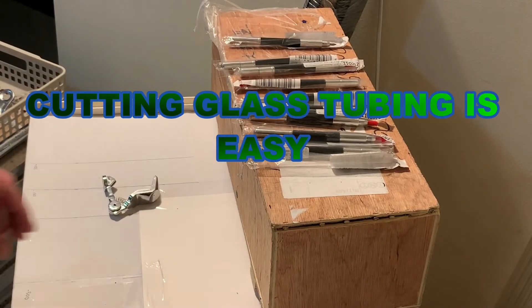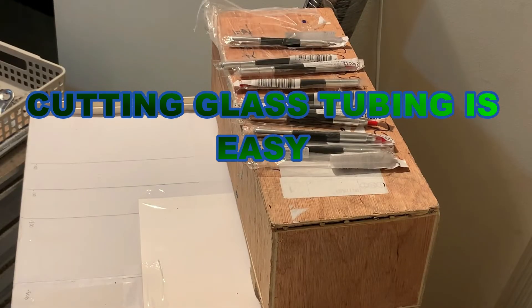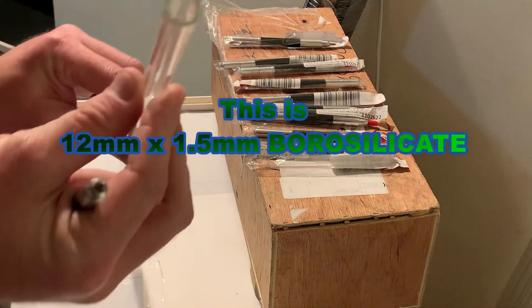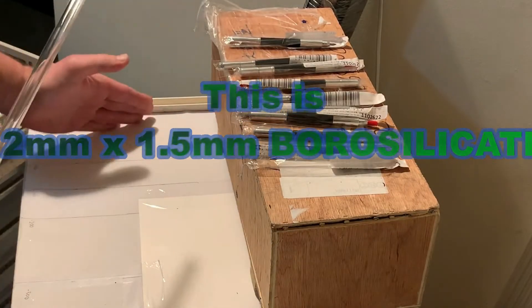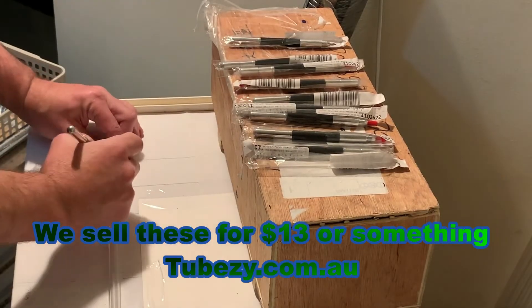Good evening. People are often asking how we cut the glass tubing, so here we go. 12mm by 1.5mm. I've got measurements marked on the desk. We cut 150mm off this one.